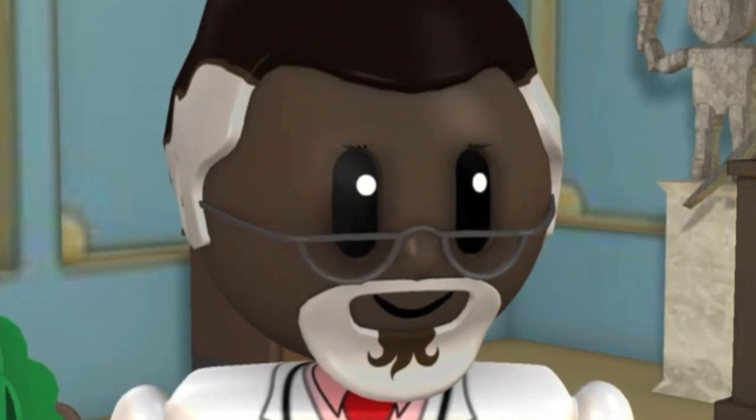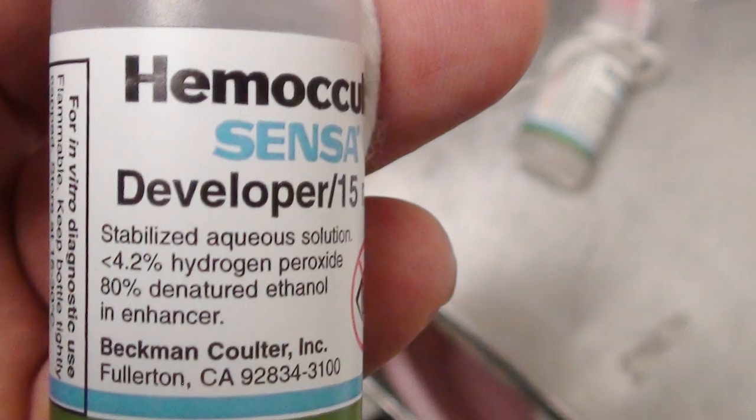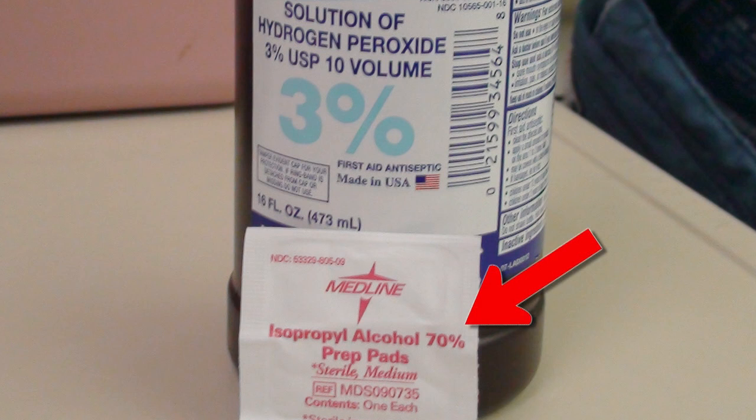I have an idea. People always get frantic when we run out of Hemacult Developer. But did you ever wonder what's actually in this stuff? The two magic ingredients are ethanol and hydrogen peroxide. Now, in the department, we have plenty of isopropyl alcohol and hydrogen peroxide. But can we make our own developer?